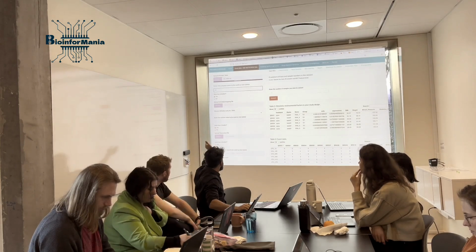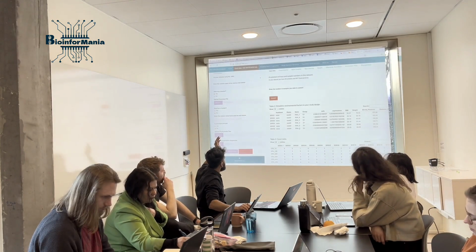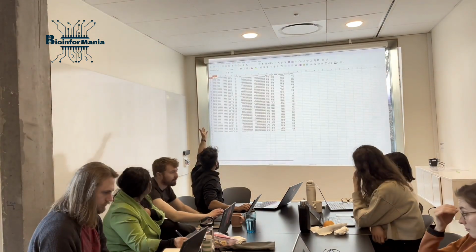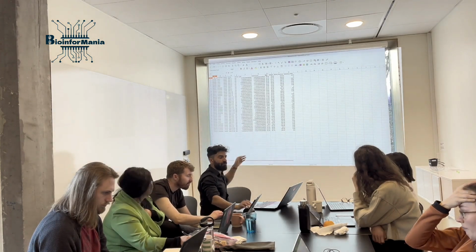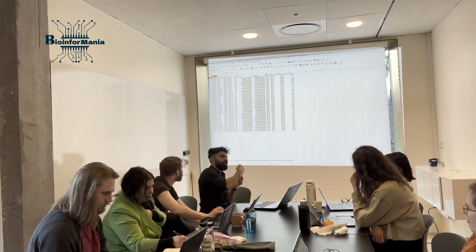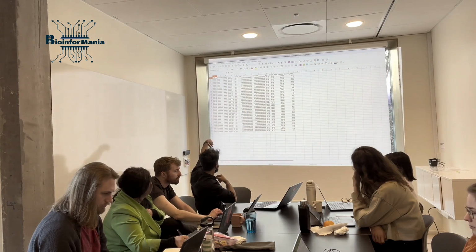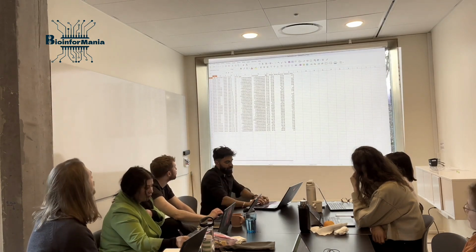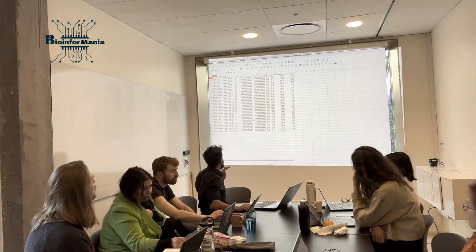Okay. So I'm going to just click and open this. You don't do anything, okay, just for me. I want to see if something happens. Again, you need to have a name for that first column that corresponds to the column name of your OTU table. And here is this one, which begins with barcode 01 to 36. I just call it ID again. Doesn't matter. Call it barcode, whatever. Call it your name.